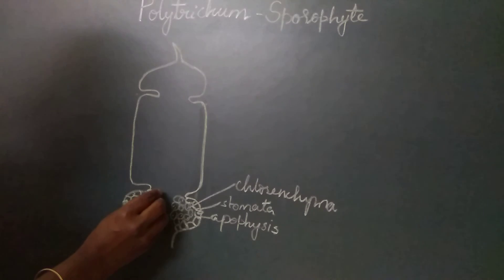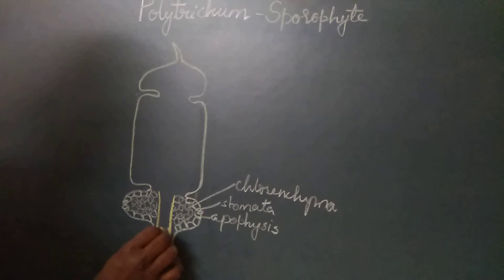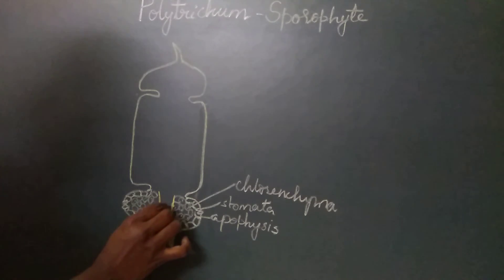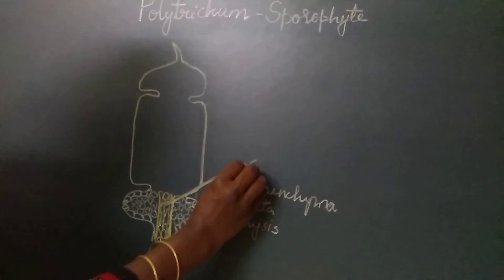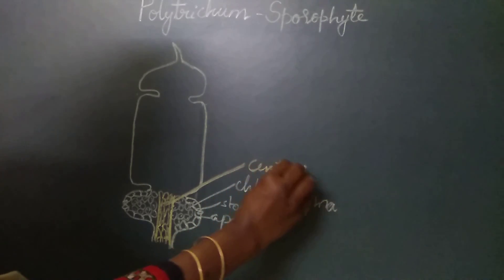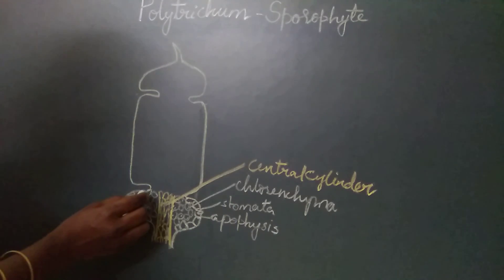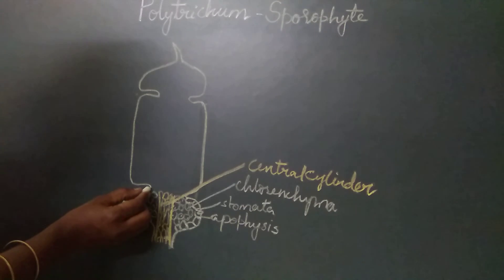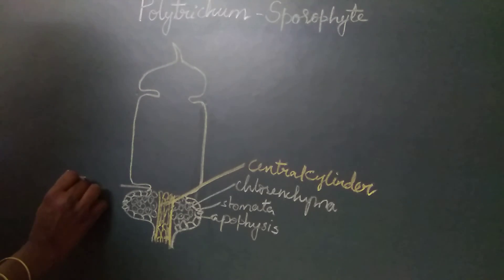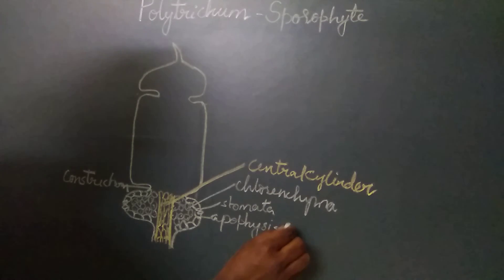The central region of the apophysis has elongated cells which are the continuation of the central cylinder in the seta zone. From the seta, the central cylinder enters into the apophysis region. Above the apophysis is the theca region, separated from it by a constriction. The apophysis is a sterile zone.